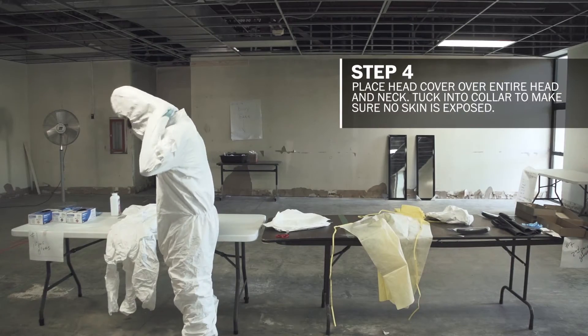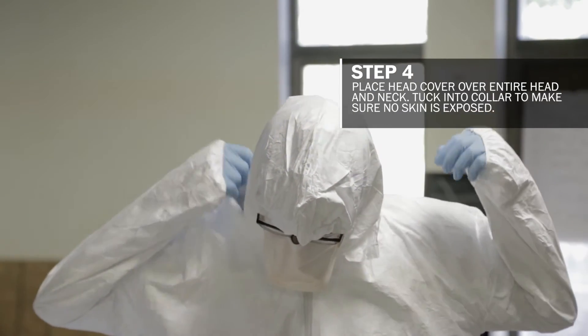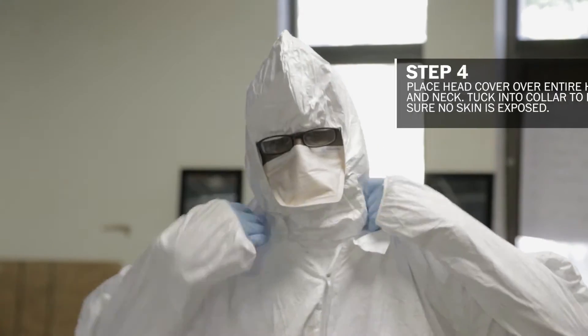Next we have a head cover. I'm tucking in the head cover into the collar to minimize the amount of exposed skin around my neck.